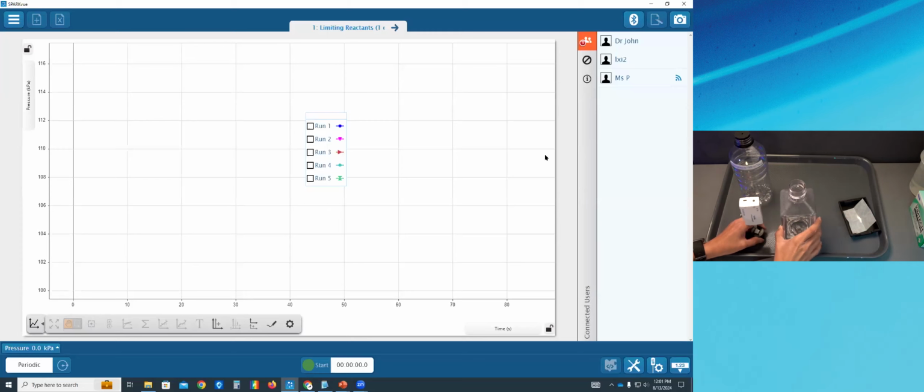Now, this is a 500 milliliter plastic Nalgene bottle. I love using these. They're easy. You can also use a 500 milliliter Erlenmeyer flask, or go to the grocery store and get a Powerade bottle. This is close to 500 milliliters. This is Powerade, and a number 6 one-hole stopper fits, which means you can do this with it. This works just almost as well. It's a slightly larger volume, so you get slightly lower pressures, but the proportions still work. So that's an easy way to do that.